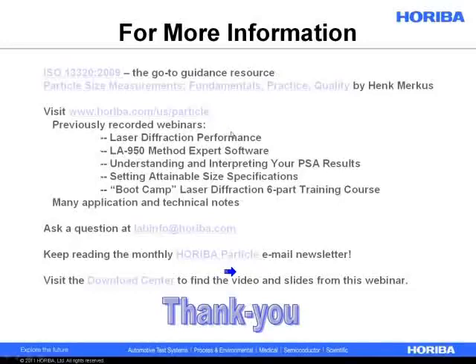Especially as a dry powder, I say, because the interparticular forces, when you get into the nanometer regime, are so strong. It always makes me laugh. You log on to sigmaaldrich.com and you see them advertising some material as a nanopowder. Well, there's no such thing as a nanopowder. It may be a nanosuspension, but there's no such thing as a nanopowder. They're going to agglomerate or aggregate into micron-sized particles simply because the interparticular forces are too strong for only atmosphere to overcome.